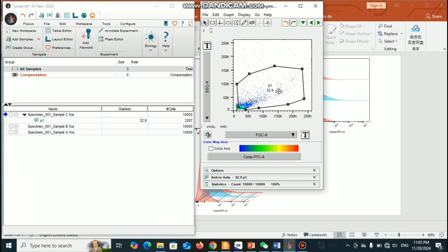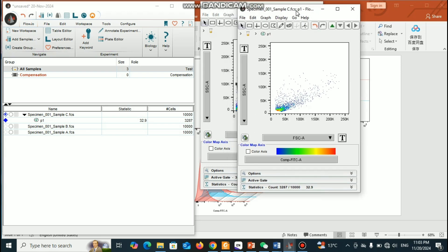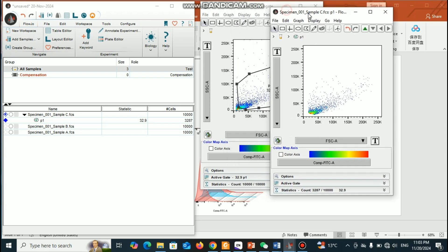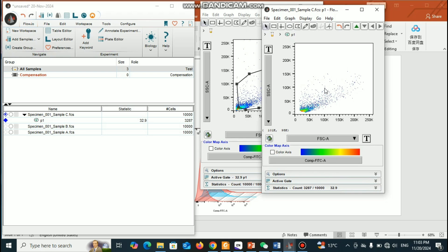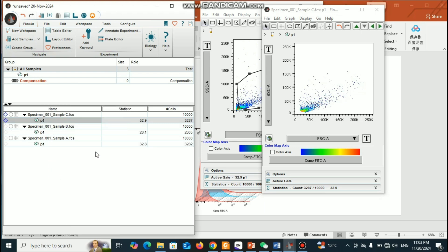Let's assume around 33 percent gating. Now here you can double-click and you will get only the live cells. So I want to analyze this data. Here you can do a right-click and then 'Copy Analysis to Group' — then you will get all of the data with the similar gating system.